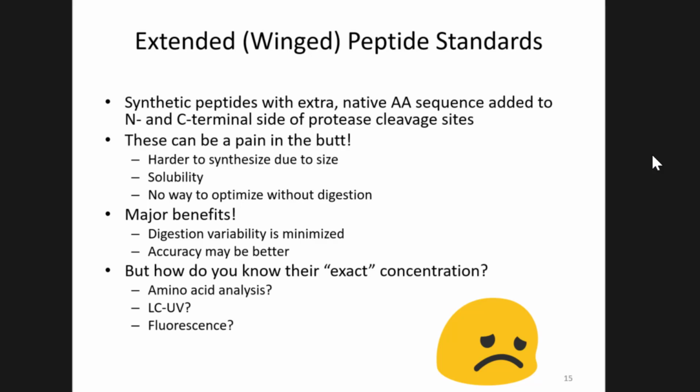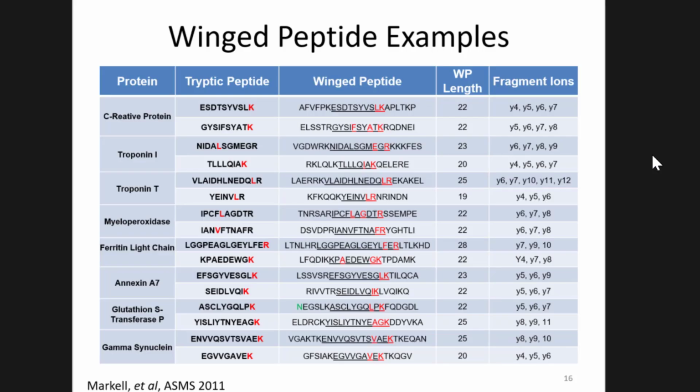So they're a bit complicated, which is why we never wrote a paper about it, because we had some inconclusive results. So these are all the proteins that we had light protein forms of. And then these are the tryptic peptides that we had C13 and N15 labeled heavy versions of, you could see with the amino acids that are labeled. These in here had internal heavy amino acids, so they're a little different.